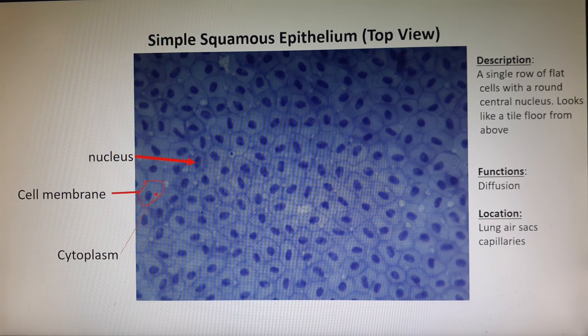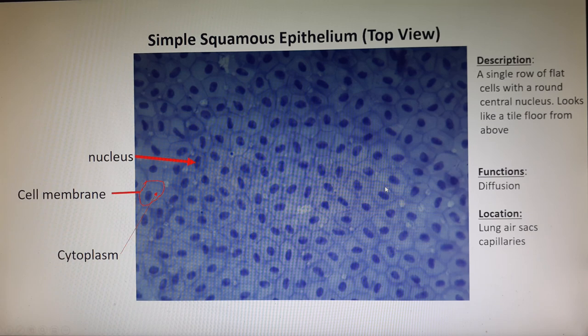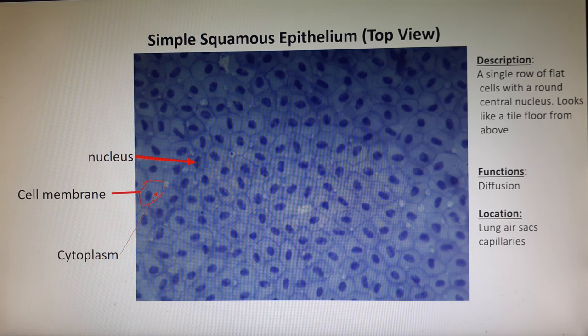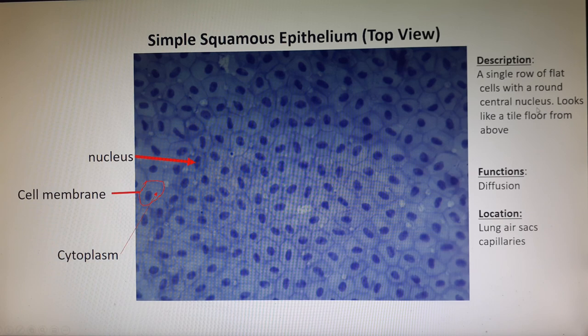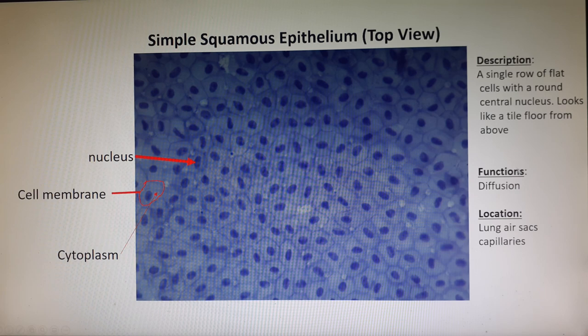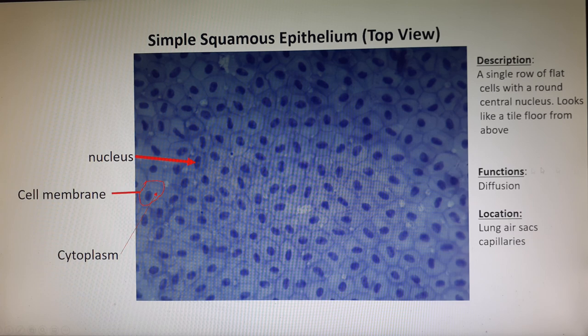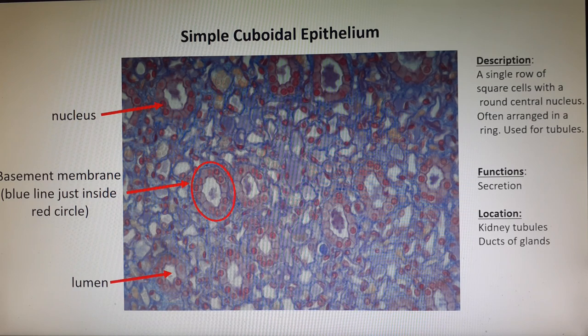This is a photomicrograph of simple squamous epithelium viewed from the top — the only view we have in the lab, so we don't have an edge view. Each cell has a large dark circle in the middle which is the nucleus; the membrane is around the edge of the cell, and the cytoplasm is everything between the membrane and the nucleus. Simple squamous is a single row of flat cells with a large central nucleus that looks like a tile floor from above. Because it is the thinnest membrane you can create, it is very good at diffusion — we find it in places like the lung air sacs and the walls of capillaries.